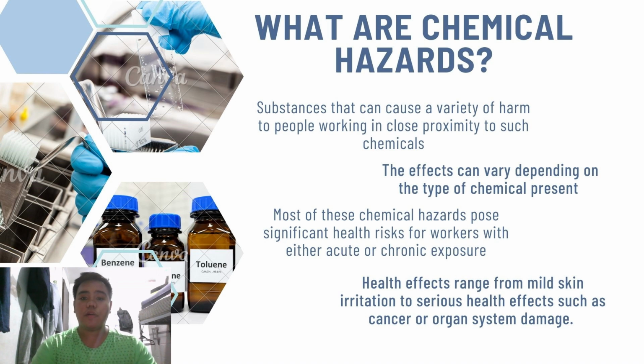So, it is very important that proper labels are placed in the storage and containers of chemicals. The purpose is to provide proper and sufficient information regarding the adverse effects of each chemical being used in the histopathology laboratory and how to handle them without causing too much harm to the workers.